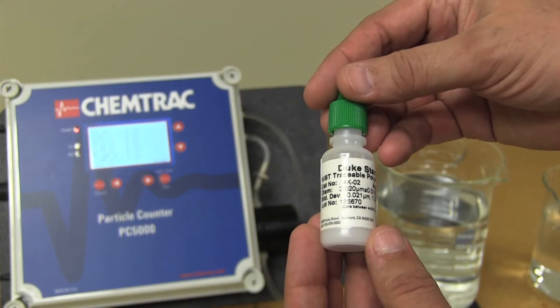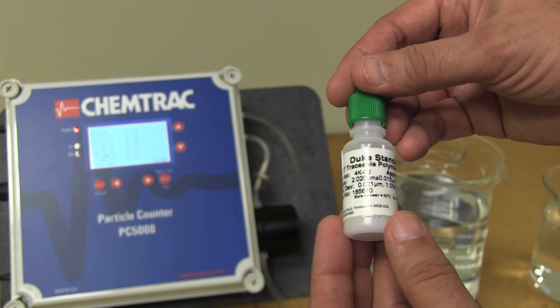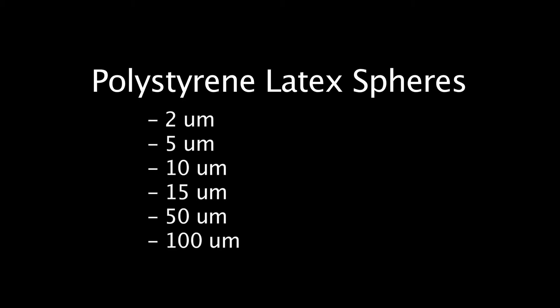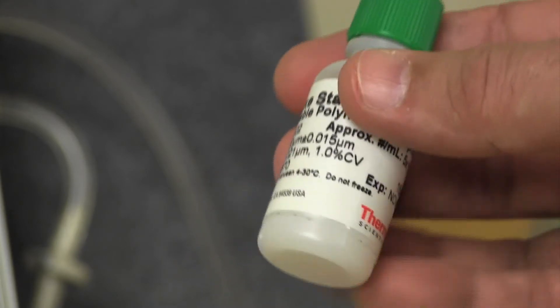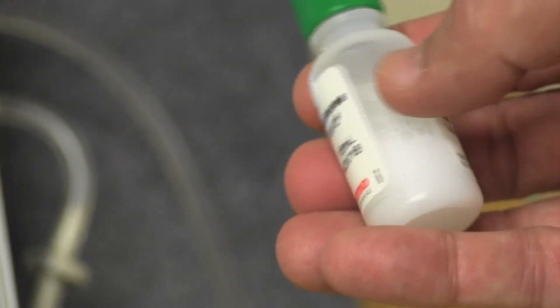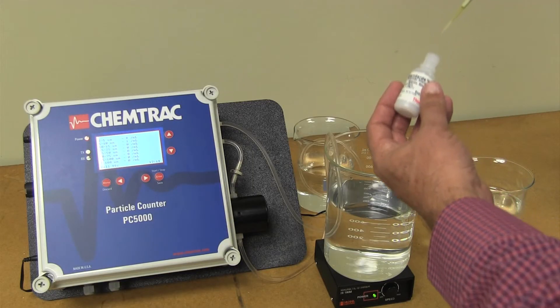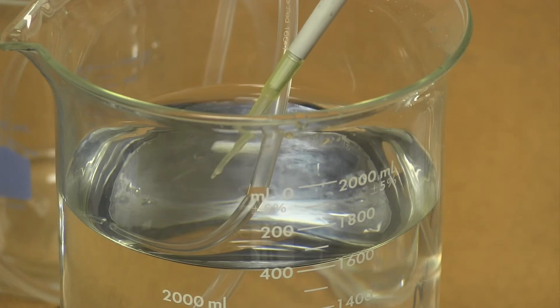Factory calibrations for the PC5000 include using NIST traceable standards made up of polystyrene latex spheres with diameters of 2, 5, 10, 15, 50, and 100 microns. Gentle agitation of the bottles allows the particles to be in proper suspension without introducing bubbles, and micropipettes are used to retrieve the required volumes of particles for the solutions.